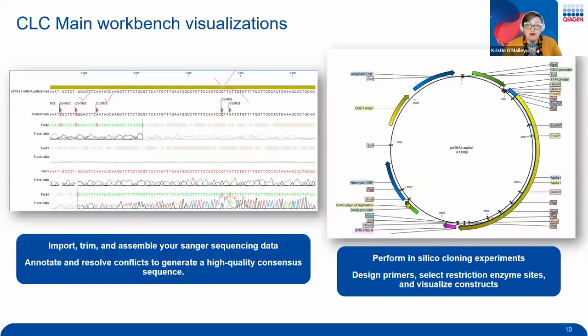So I'll show you how to resolve these conflicts and how to make sure that your consensus sequence is of the utmost quality that it could possibly be.